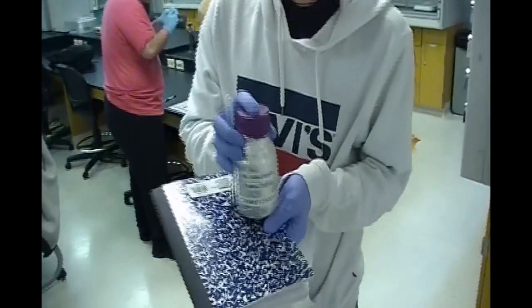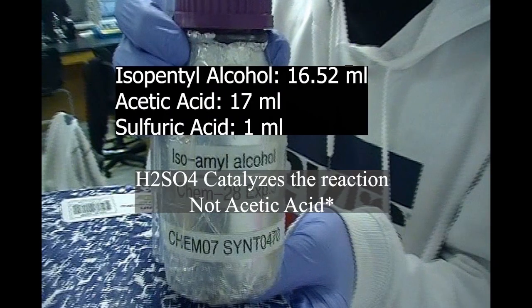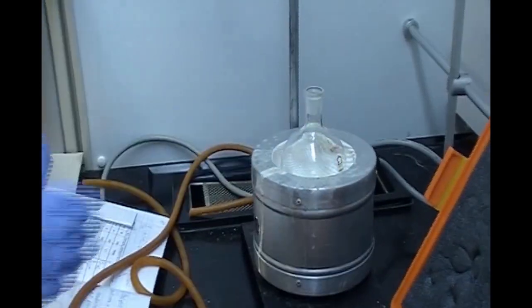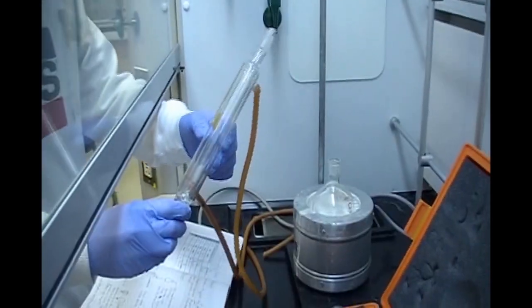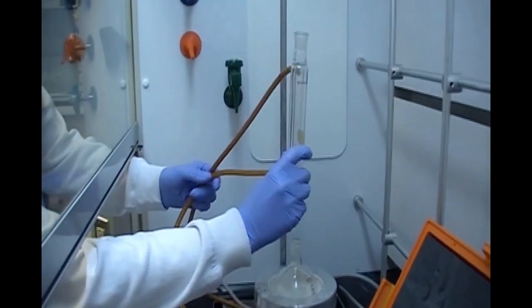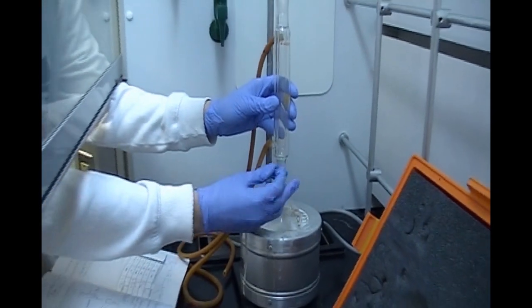To start, we gathered our materials. We used 16.52 milliliters of isopentyl alcohol with 17 milliliters of acetic acid in order to catalyze the reaction. We included 1 milliliter of sulfuric acid along with some boiling chips. This was combined into a 50 milliliter round bottom flask in order to perform under reflux as shown on screen. On the bottom, water flowed into the condenser. On the top, water flowed out.